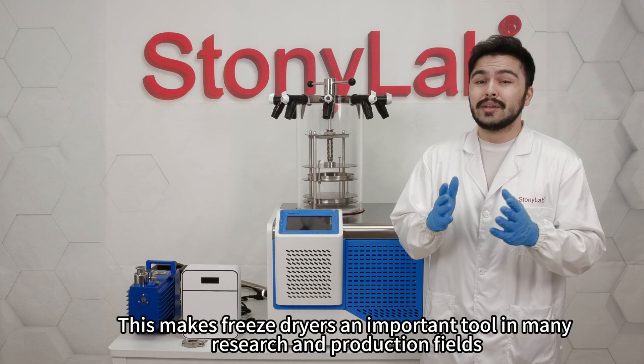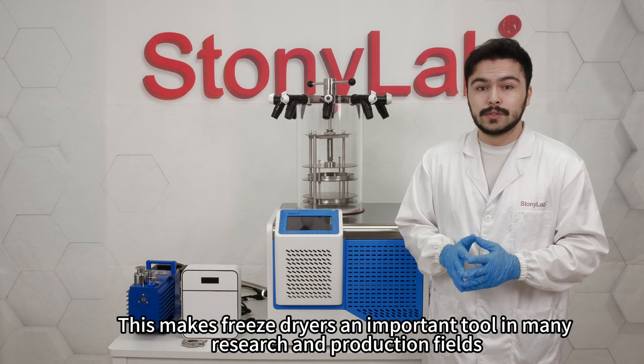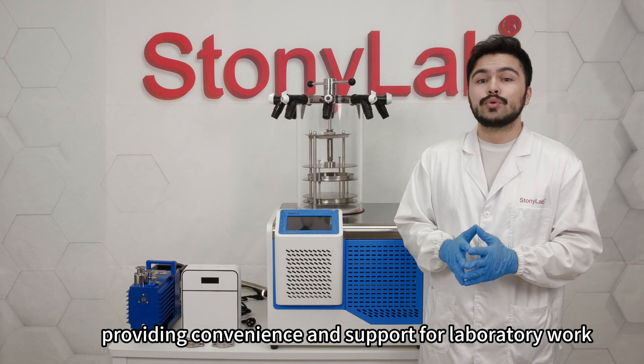This makes freeze dryers an important tool in many new research and production fields, providing convenience and support for laboratory work.